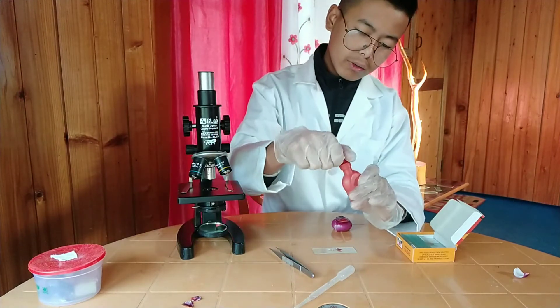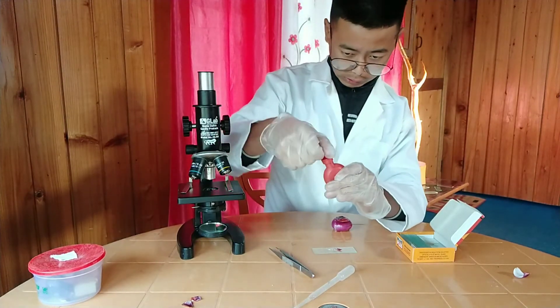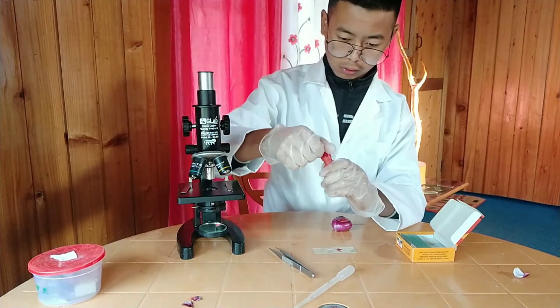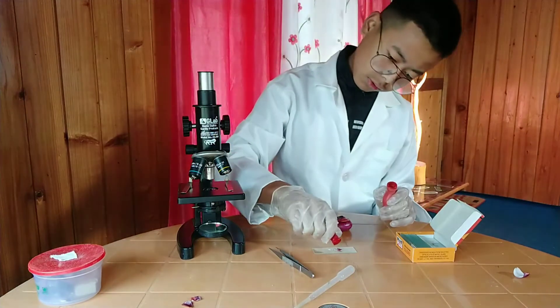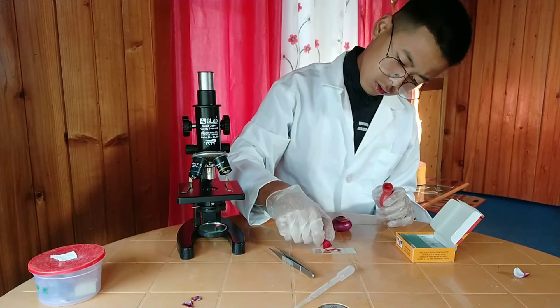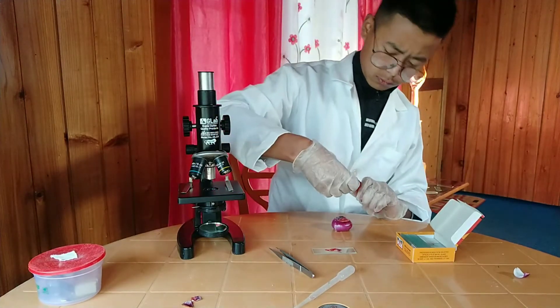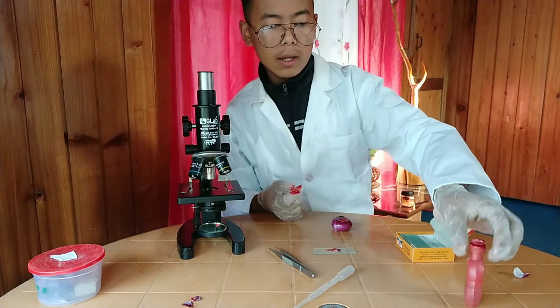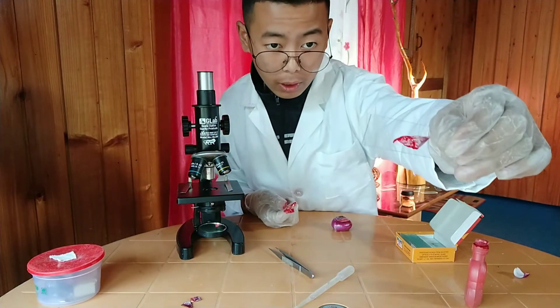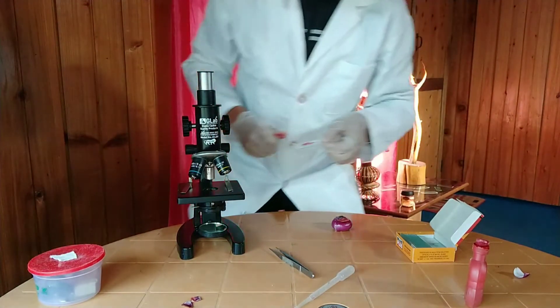Be careful, you'll get the stain on your hand. Stain it properly with safranine — safranine and I are enemies, you know, from my childhood only. Look, I've stained it. Now let's keep it under the compound microscope.